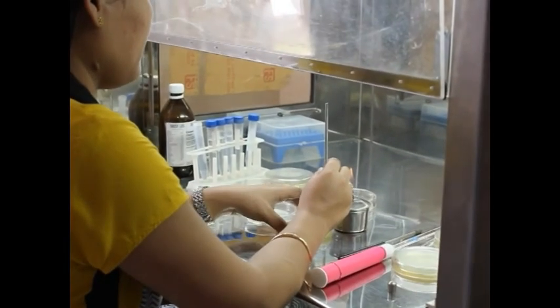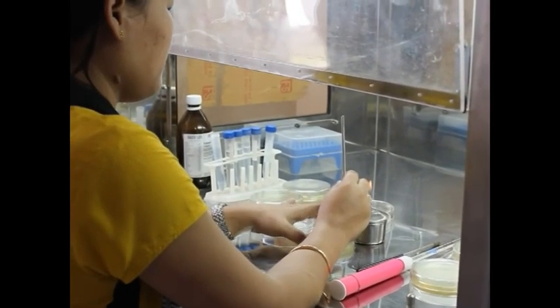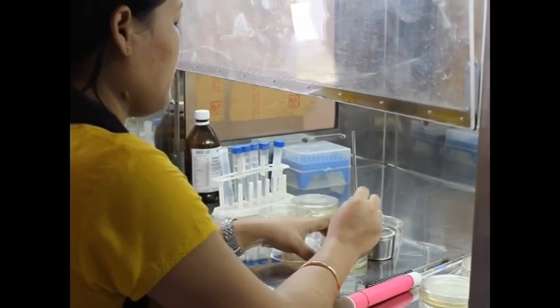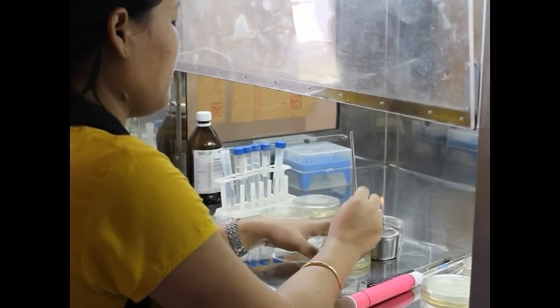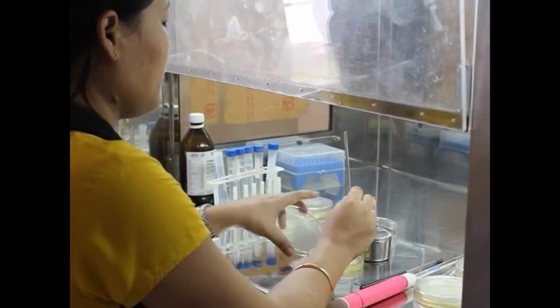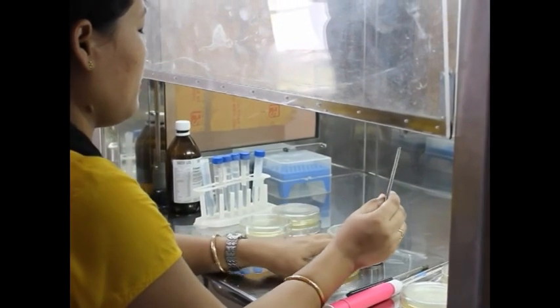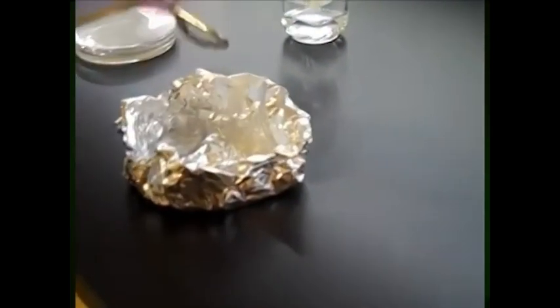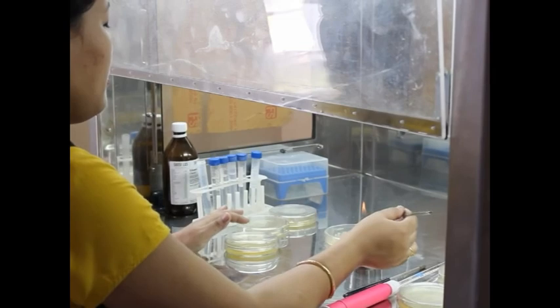Further, aseptically, a loopful of the culture is transferred onto the appropriately labeled nutrient agar plates. Then the glass rod is removed from the beaker and placed on the Petri plate. The glass rod is gently pressed and rotated back and forth for spreading the culture over the agar surface. Then the glass rod is immersed in the alcohol again and then reflamed to sterilize it.